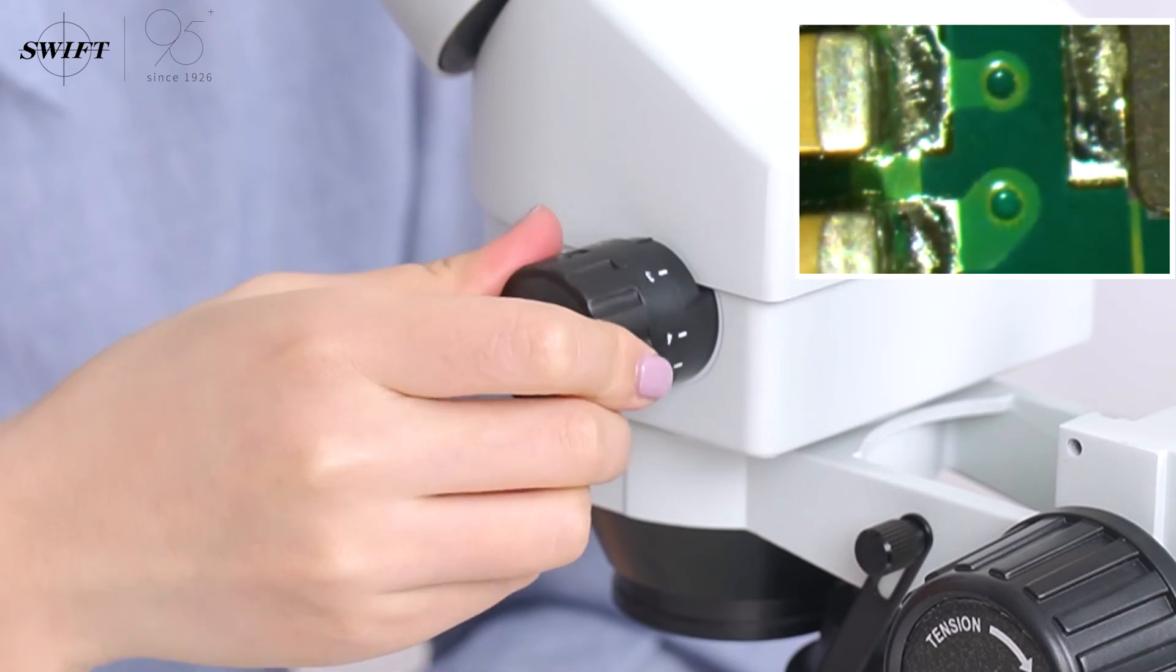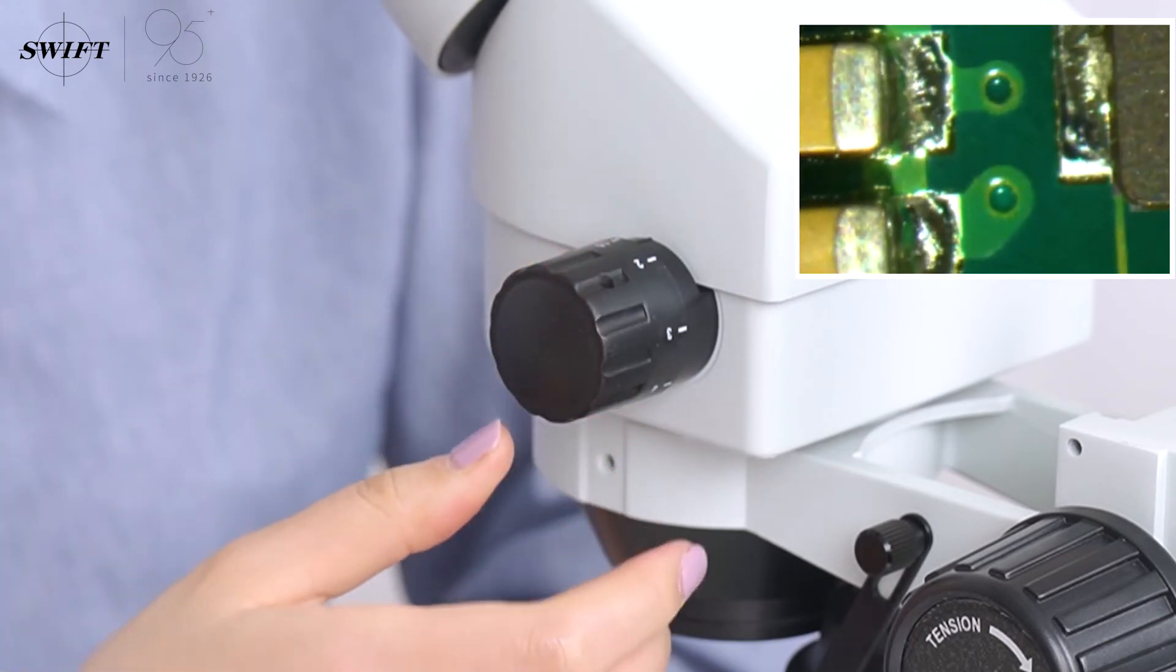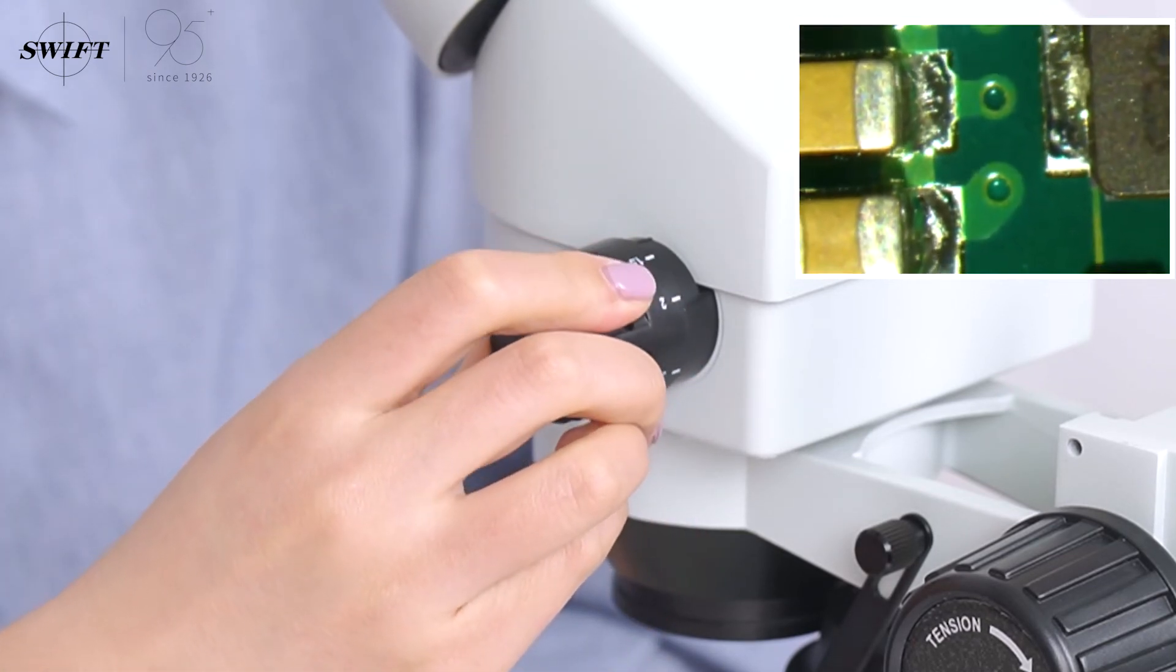From high magnification to low magnification, the image under the microscope is very clear in the process of continuous zooming.